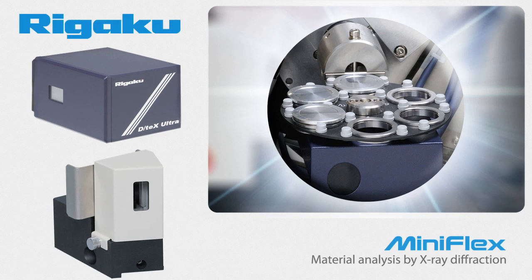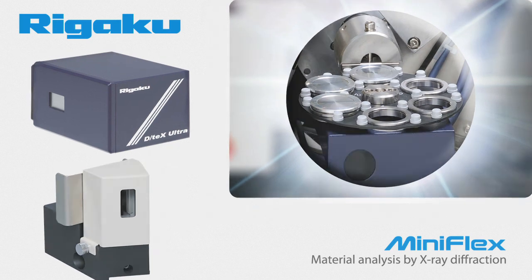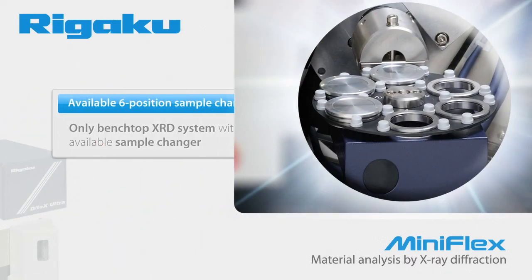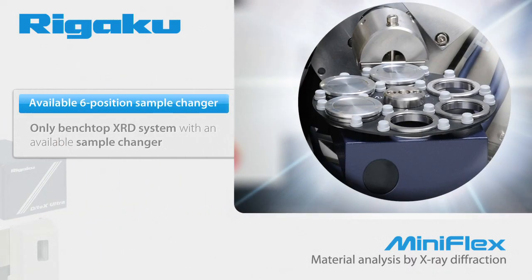Only the MiniFlex offers you configurations that give you maximum flexibility in a benchtop package. Is speed your biggest issue? The optional DTEX Ultra high-speed detector coupled with the new higher power X-ray source will give you the fastest possible data collection in a compact diffractometer. The only way to truly take advantage of the higher speed and improve your throughput is to utilize an automatic sample changer. The MiniFlex is the only benchtop XRD system with an available sample changer.